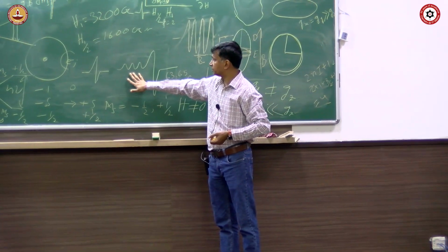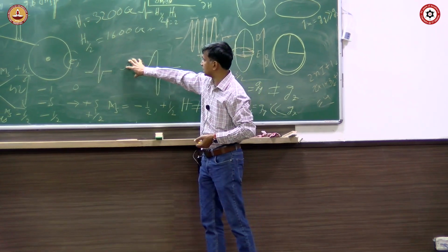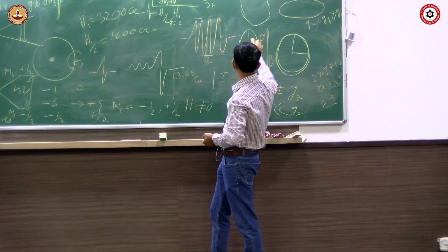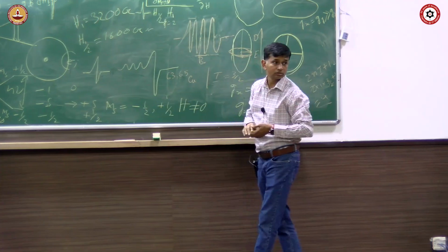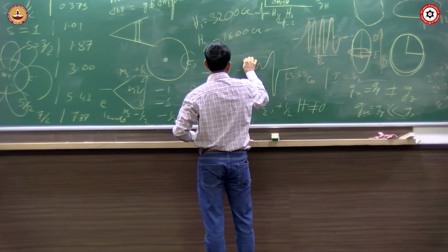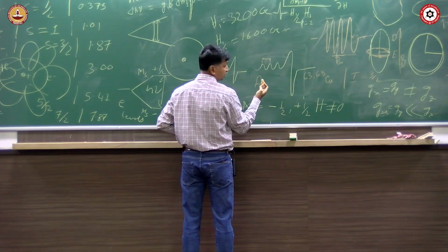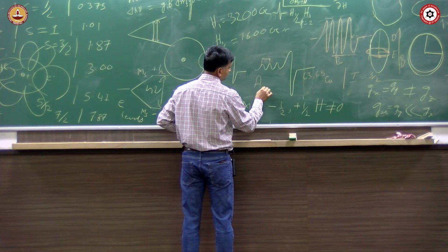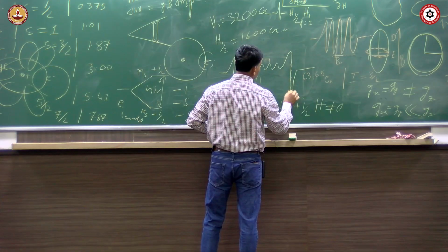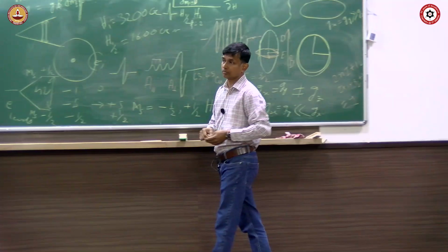So now this is the component, this is G parallel and G perpendicular. This can come to this side, or some of them can come to this side, depending upon the shape. This is the G parallel component, where the separation is equivalent to the coupling constant due to the parallel component. And somewhere it will come here, somewhere it will be like this, it is actually the coupling constant due to G perpendicular.